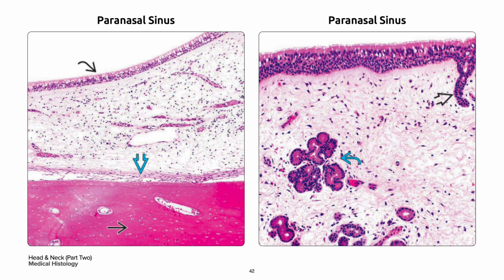On your left are the paranasal sinuses, which are lined with ciliated pseudostratified Schneiderian mucosa with mucous cells in curved black arrow. This is in continuity with the nasal mucosa via the ostia. The mucosa is thinner and attaches to the periosteum in bold blue arrow of the various sinus bones in single black arrow.